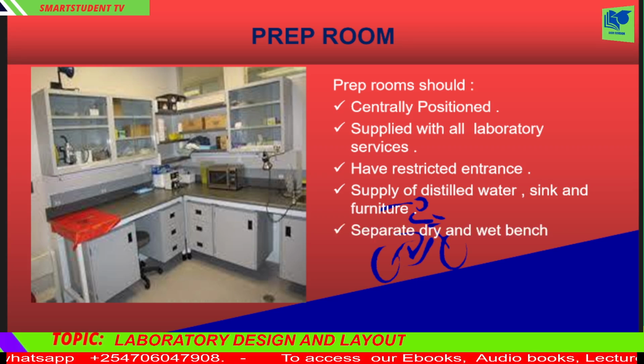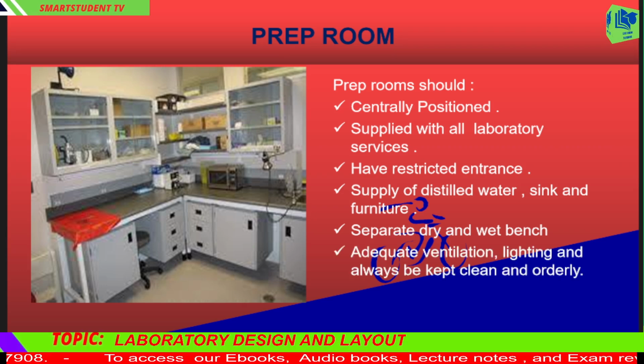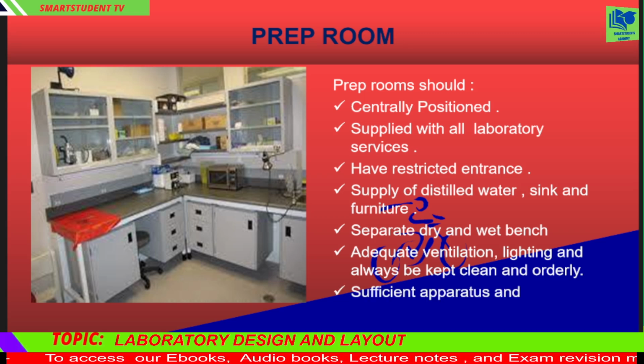5. Have proper ventilation, lighting, and always be kept clean and orderly. 6. Have enough burettes, pipettes, volumetric flasks, etc. to enable bulk preparation of reagents. How about a laboratory store?